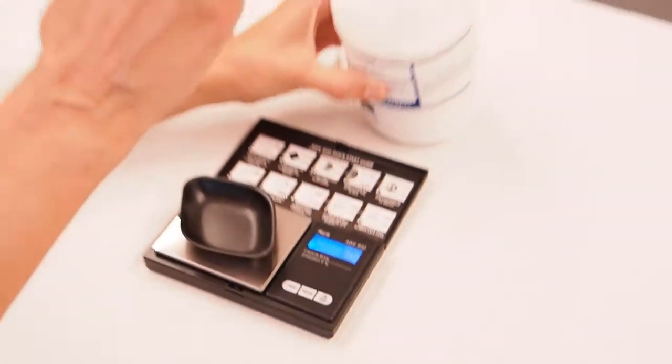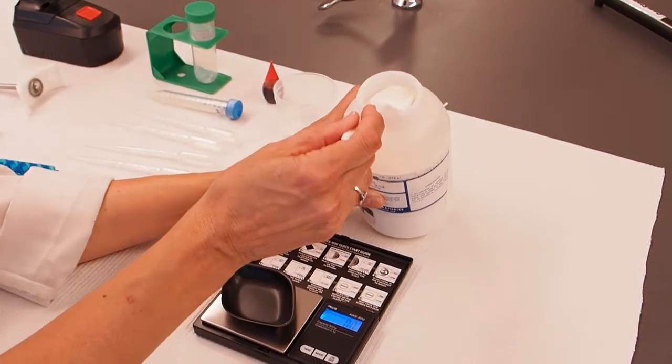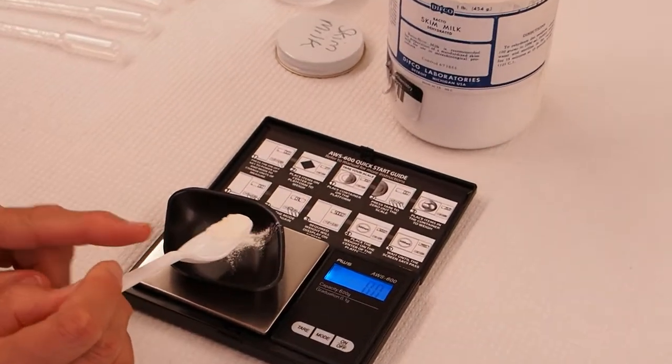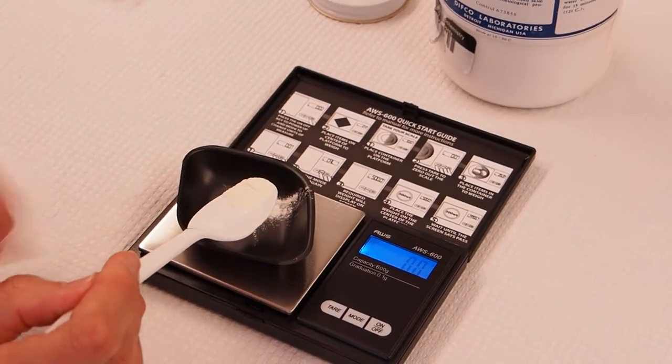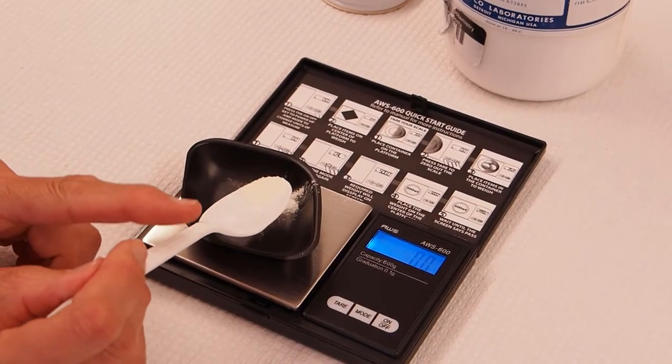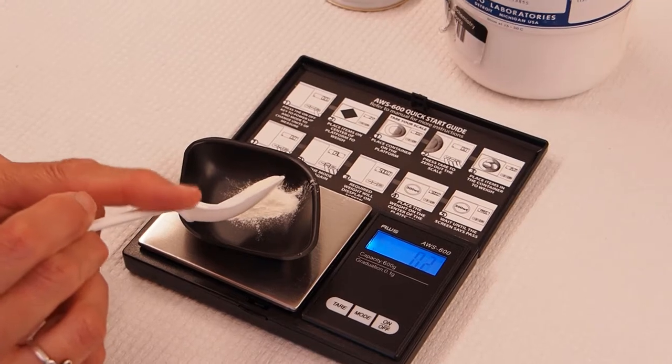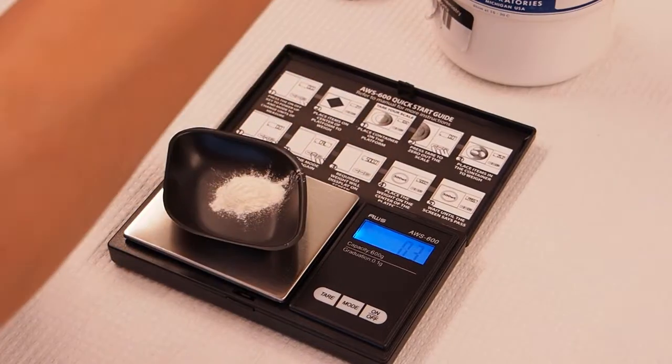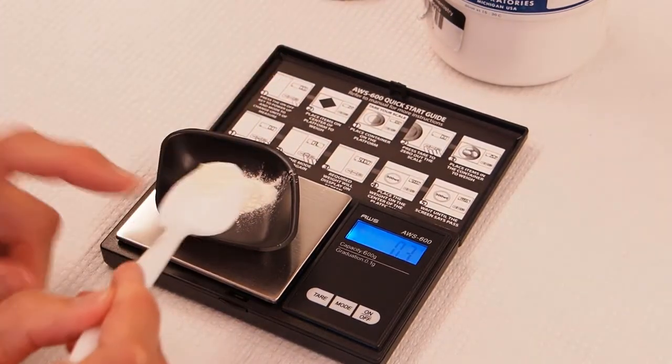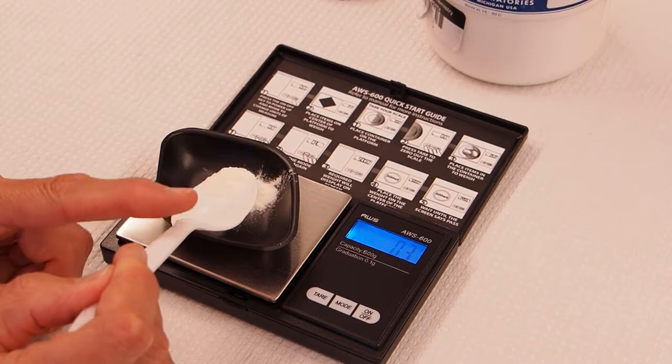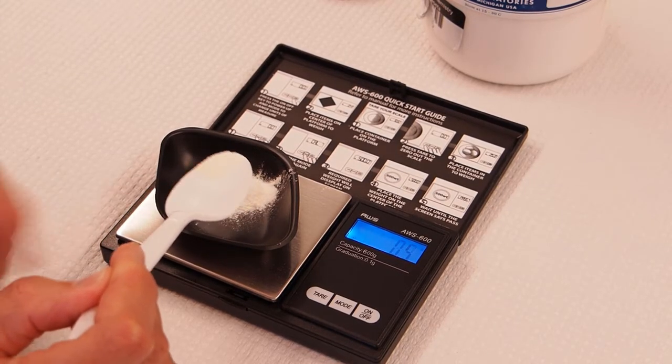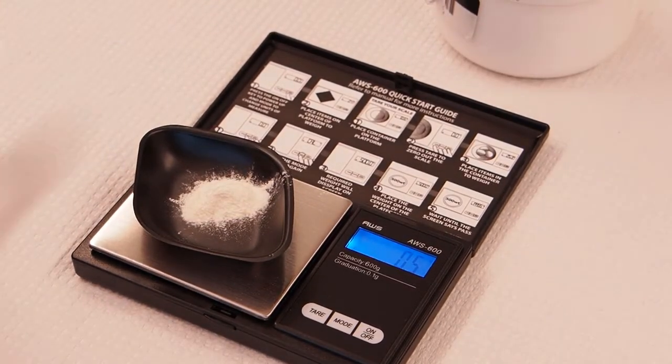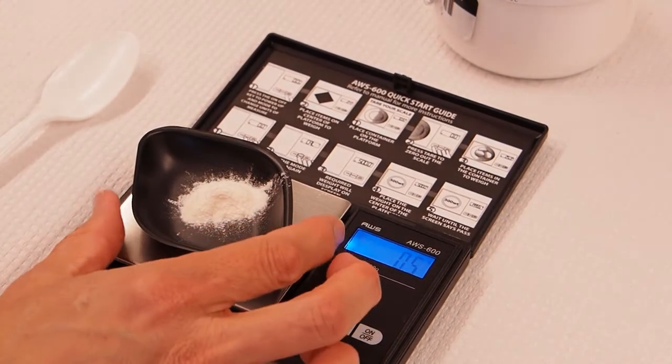We want one half gram, which is 0.5 grams, of milk powder. I'm going to tap my little spoon that has some powder on it until it reads 0.5. I don't want to dump it on there because I don't want to put too much of the chemical on there right away. I just want to do it slowly until I get the mass I want. And there I am, I am at 0.5 grams. I have the amount of milk powder that I want.